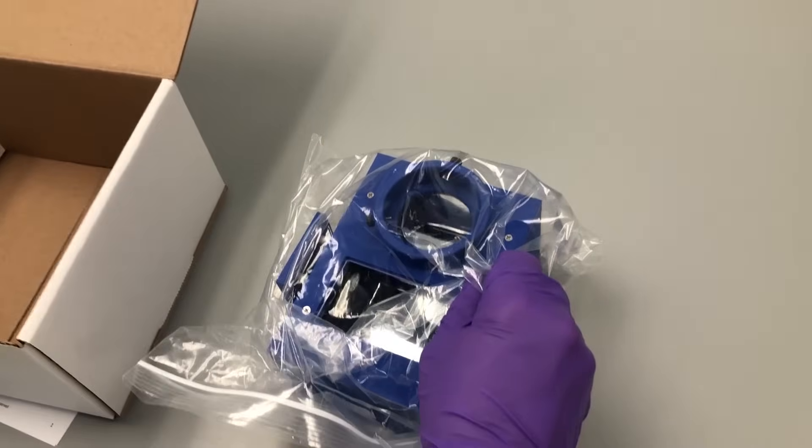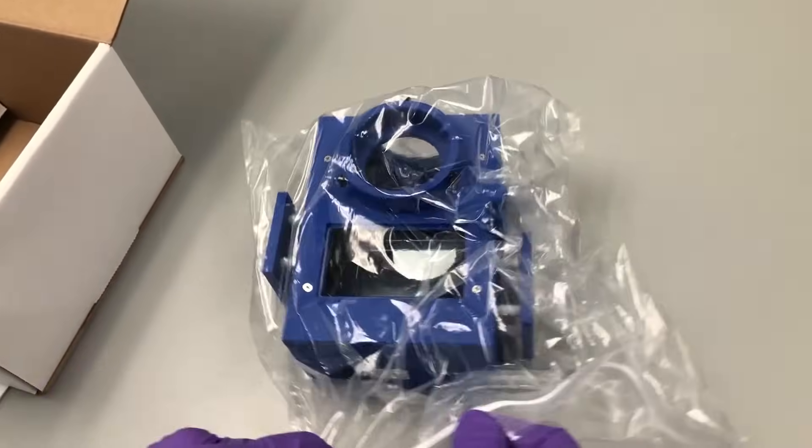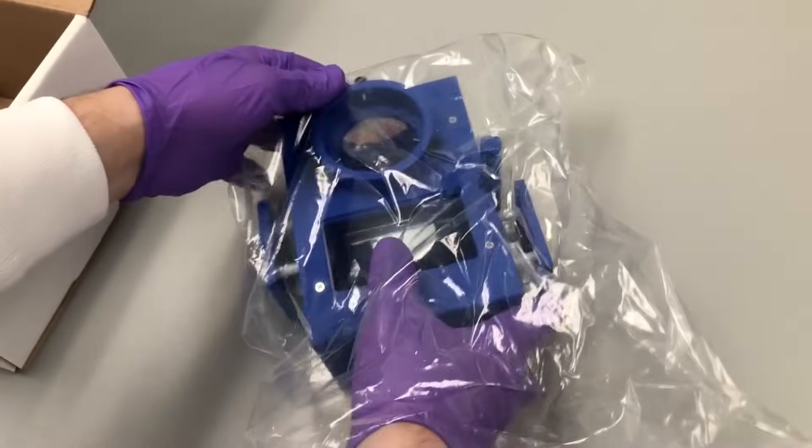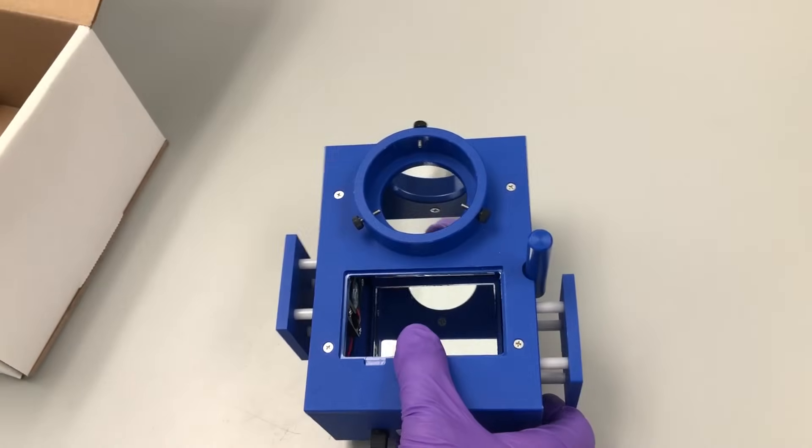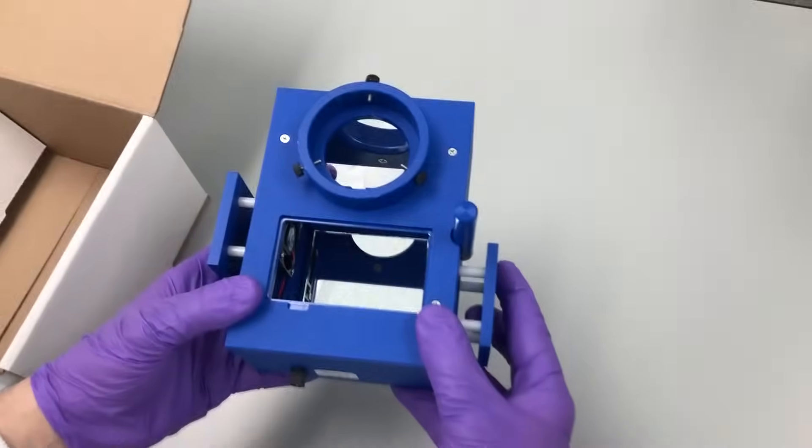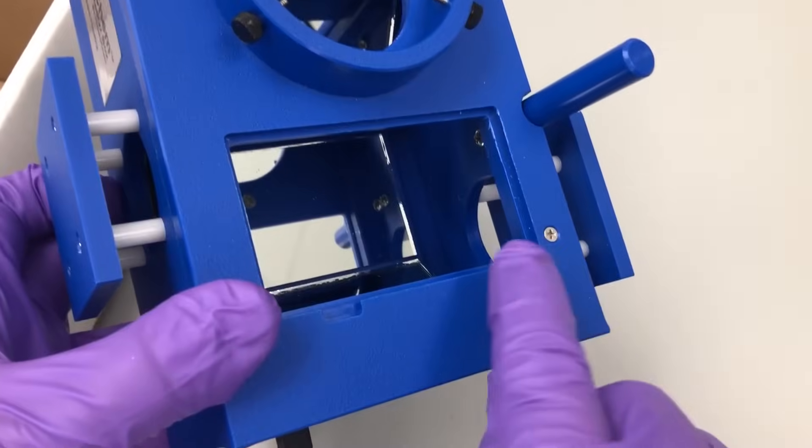The photoredox box itself comes wrapped to avoid scratches to the reaction chamber mirrors. Once you have removed the photoreactor from the plastic, you can view the various mirrors that are placed at specific angles throughout the reaction chamber.